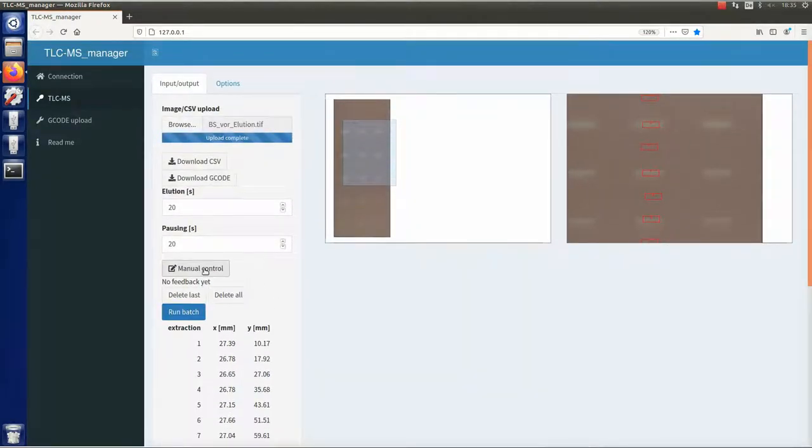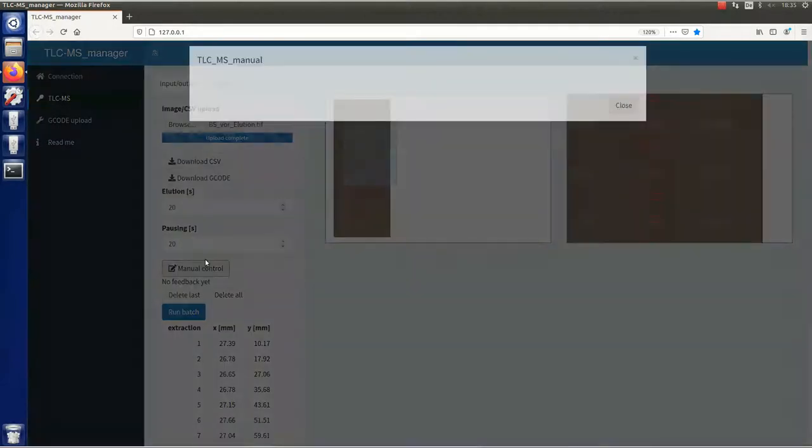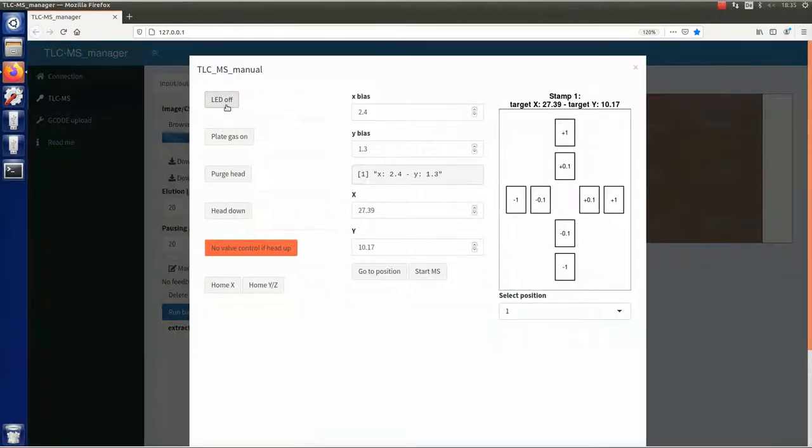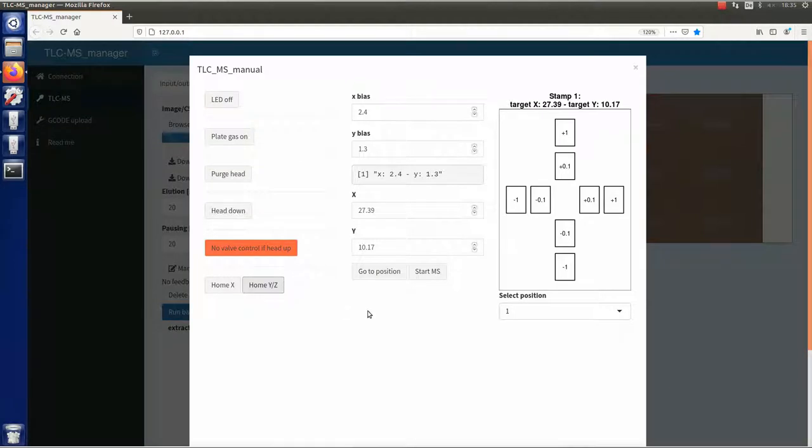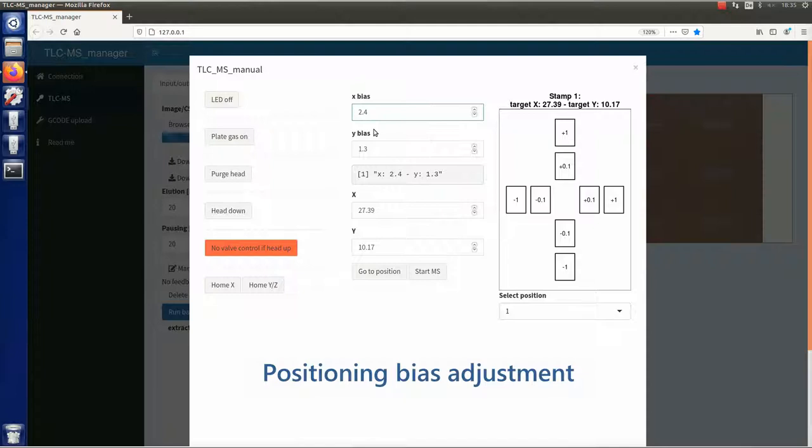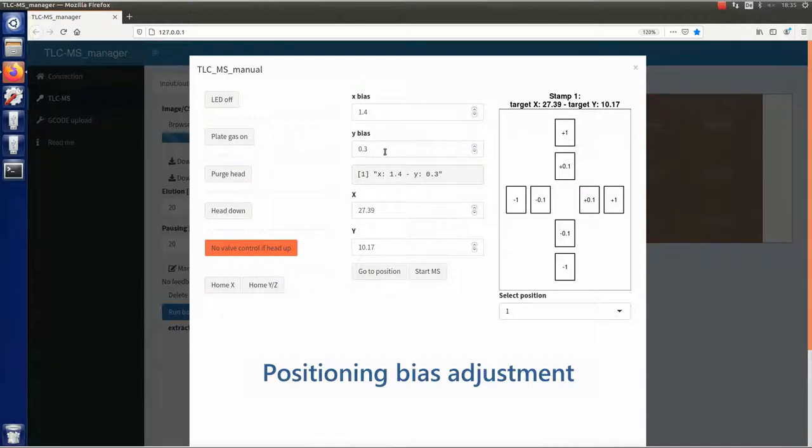Before starting the measurement, the Auto-TLC LC-MS interface has to be prepared. The motors responsible for the plate holder movement have to be homed to synchronize software and hardware. The positioning bias for each individual plate has to be adjusted. For this purpose, the plate holder is moved to one of the chosen elution zones. The position of the interface's laser crosshair indicates whether the hardware and software are correctly aligned.